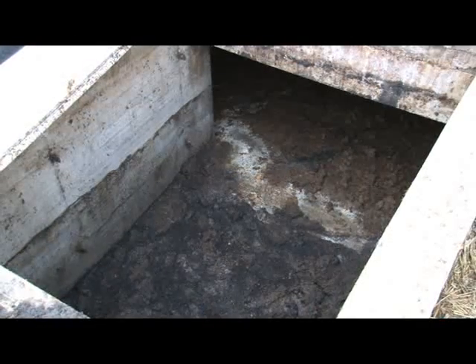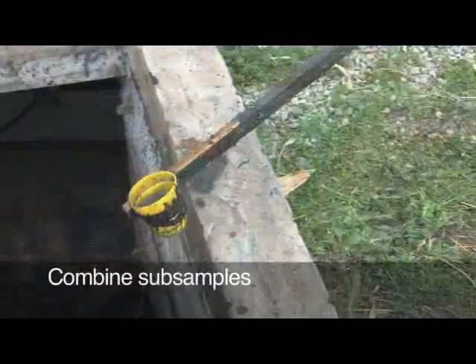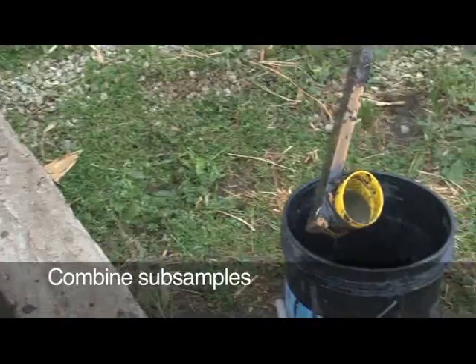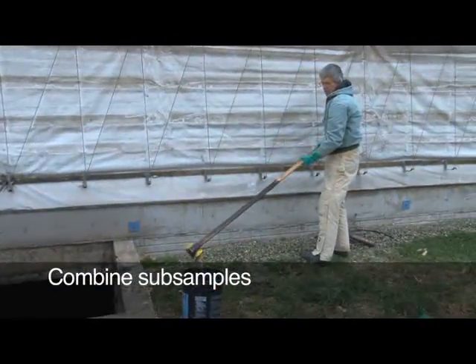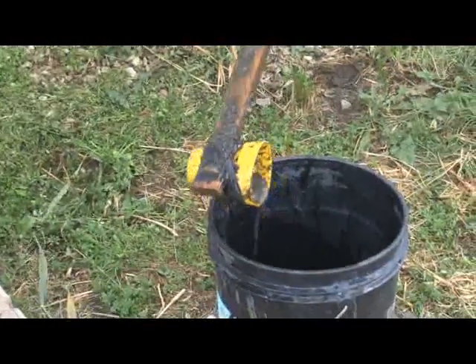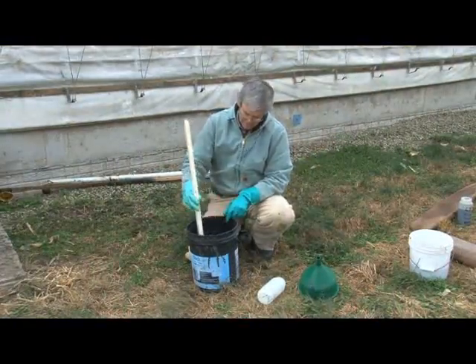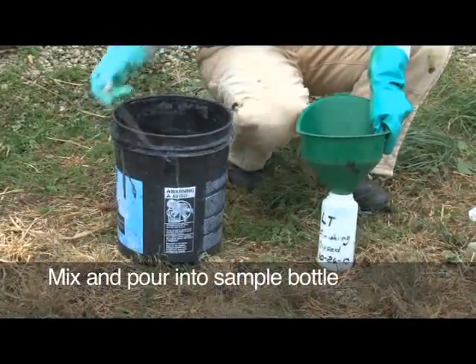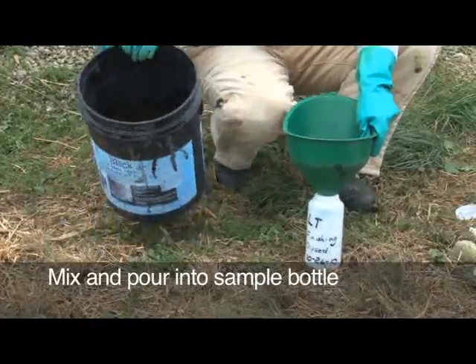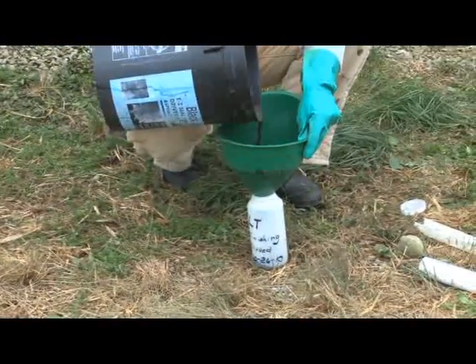After 3 subsamples have been taken from one port, move on to all remaining ports and access locations, repeating the process of mixing and taking 3 subsamples. After subsamples are collected, stir or swirl the bucket to mix the subsamples. Using the funnel, pour the mixed sample into the bottle until the bottle is about 3/4 full.